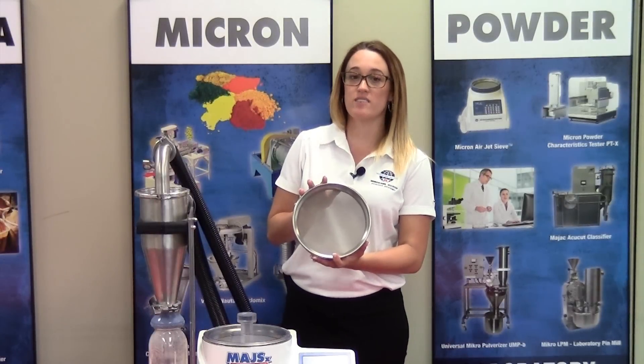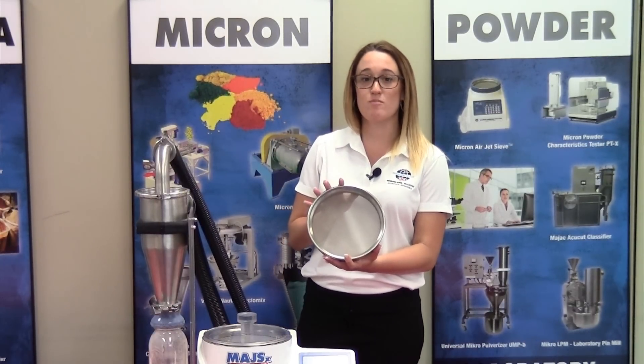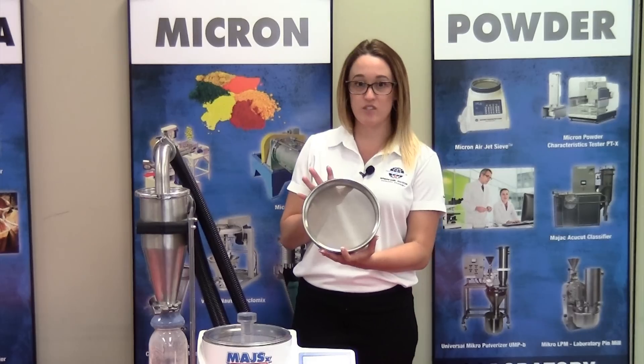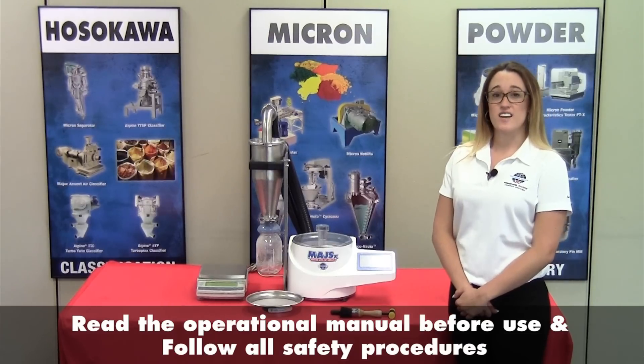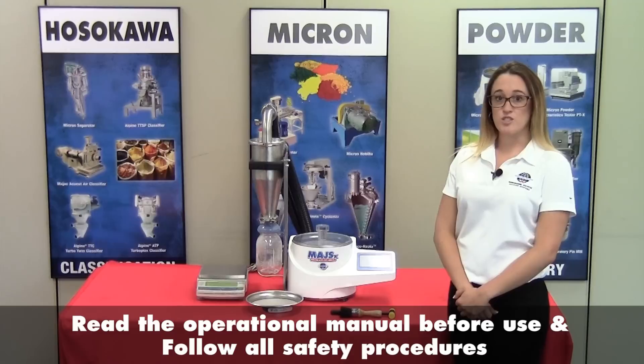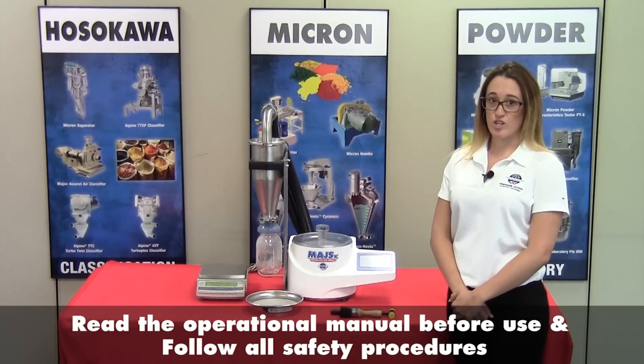The most important thing about a sieve screen is the integrity. It cannot have any mars, dents, or wavy screens, as this will skew your results. Before this device is operated, you should read the operating manual and follow your company's safety precautions.